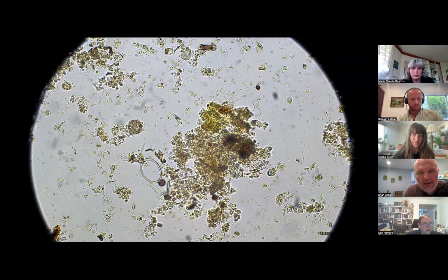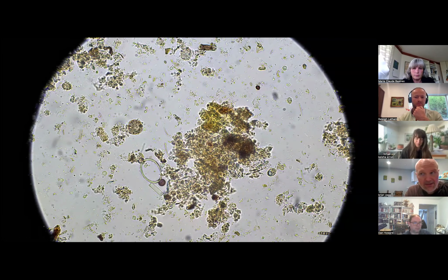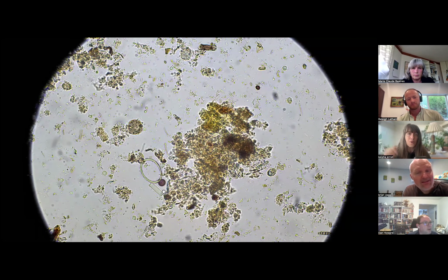I got a cool one here. What is that? This is one of those ones that always kind of intrigued me. I saw them and I'm like, what is this ring? It's not a testate amoeba. It's not a test that's there. Anybody know? I have an idea what I think it is.